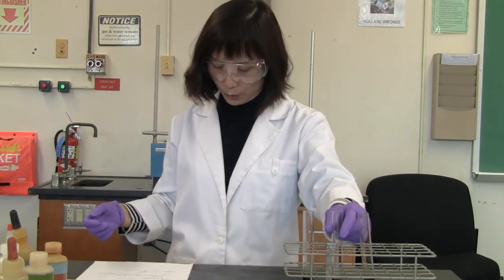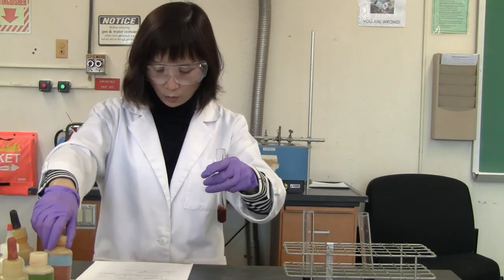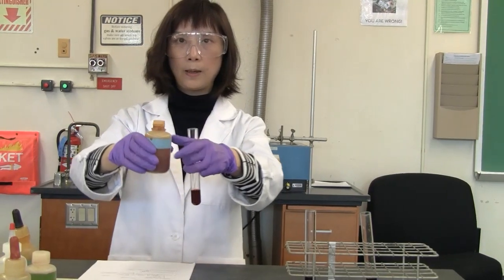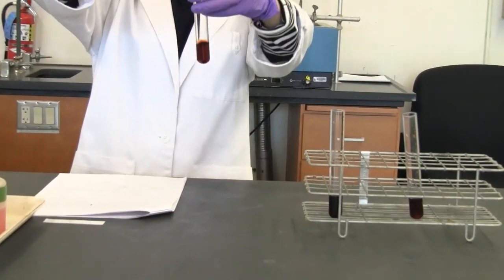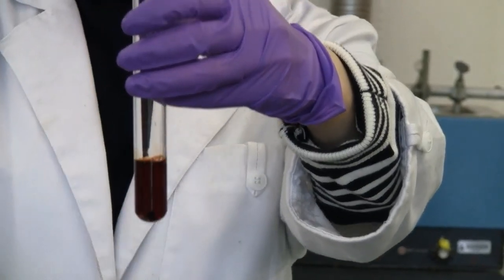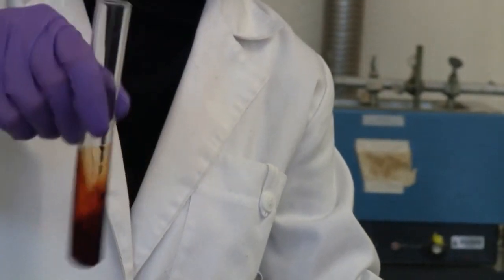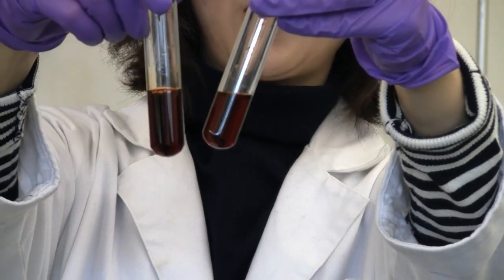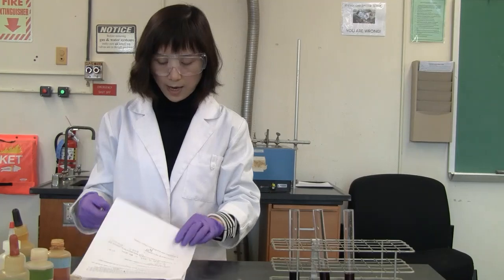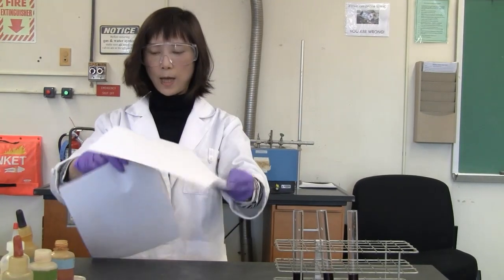To test tube number 2, we're going to add 20 drops of the 0.1 molar iron chloride. So you're going to observe the color change. So add kind of quick. Okay, now compared to the original one, what do you think? Is it darker or lighter? Okay. So this is number 2. Again, we're going to answer question 7 and 8 based on that.